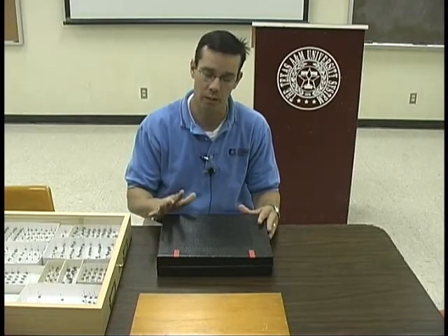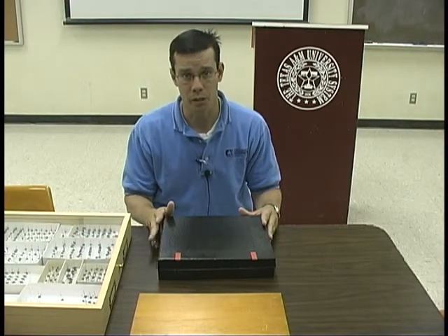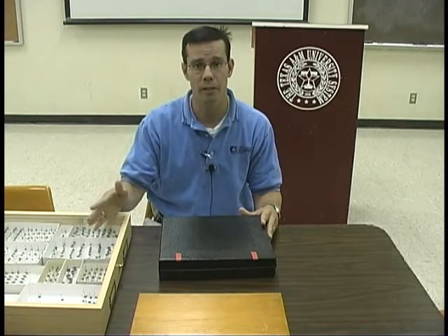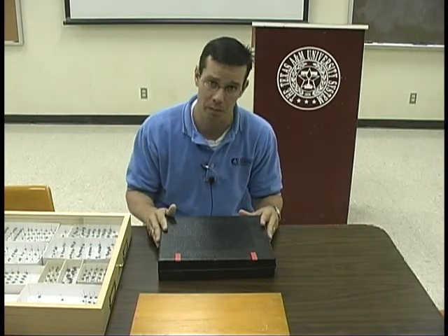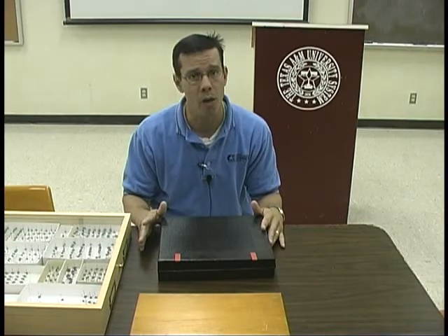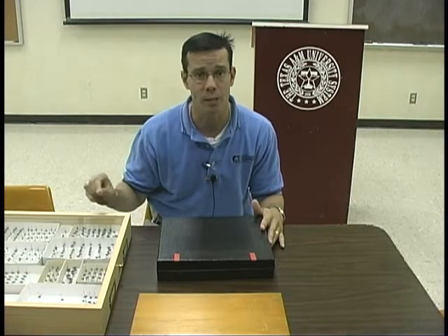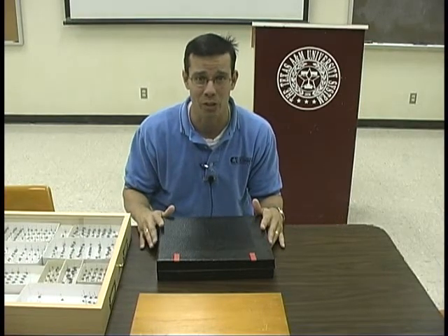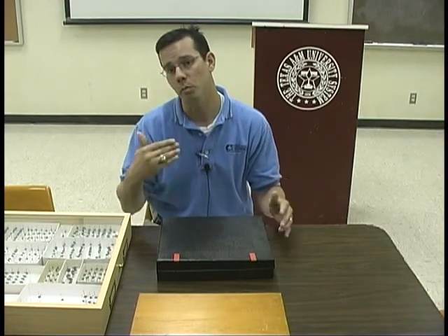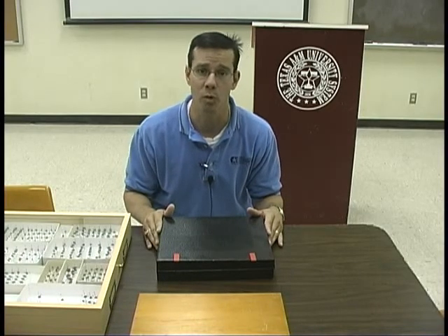With each of these different boxes, one thing to recognize is that these insects represent something very important to other insects — food. There are certain insects that will get into these Cornell drawers and devour your insect specimens. So it's important that your Cornell drawer has a place where you can put mothballs. You want to make sure you secure them so they don't freely move throughout the drawer, because that will destroy your insects just as well. The fumes from the mothballs will repel those insects from coming in and feeding on the ones you collected.